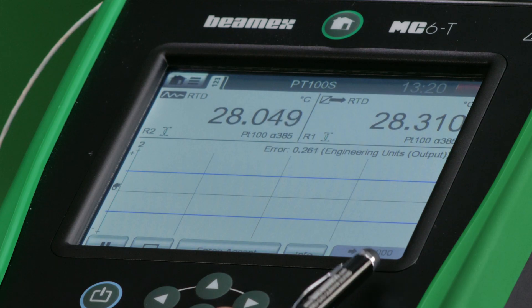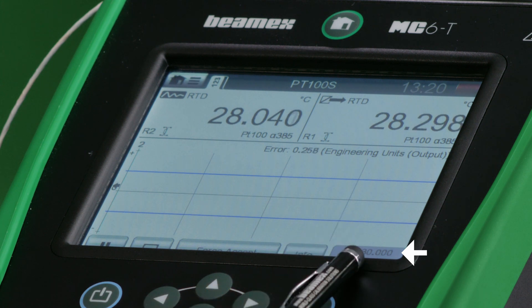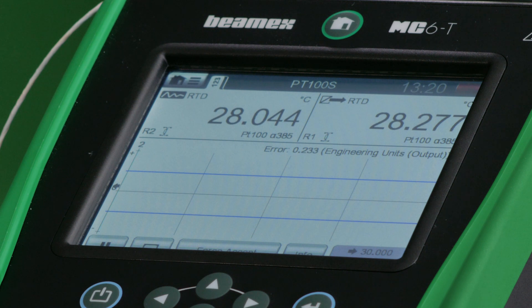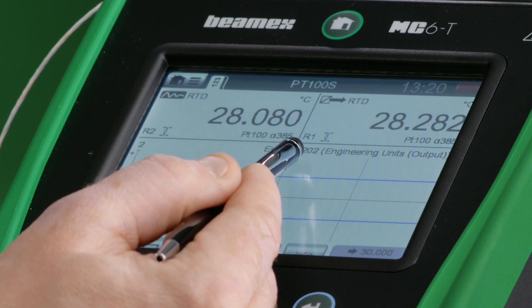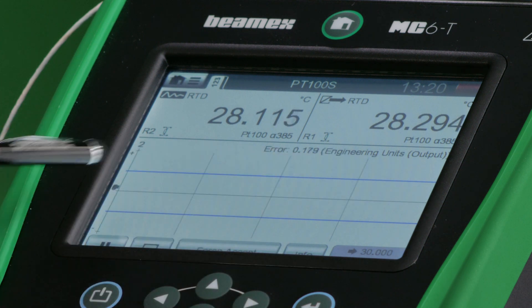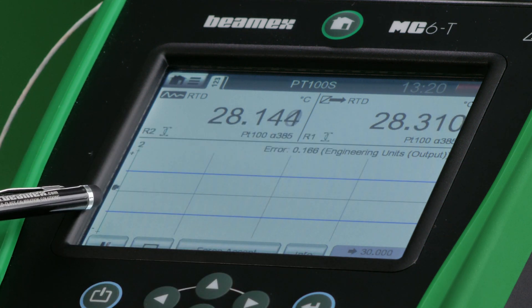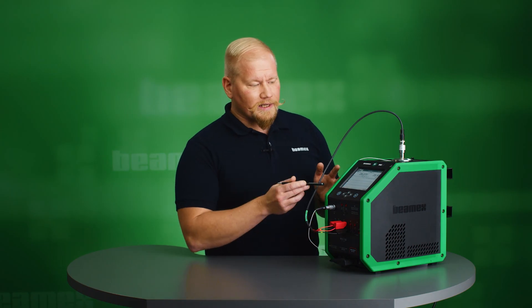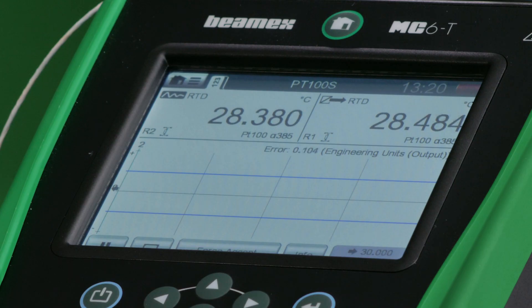I'll hit start and begin my calibration sequence. On screen, you can see my set point — the first point is going to be 30 degrees Celsius. The MC6T is constantly calculating the error, comparing the reference to my sensor values, and showing the error value as well as a graphical view. You'll see a green dot traveling between two blue lines — if it's below or above, it's a failed calibration; as long as it's inside, it stays green and is a pass. This also documents the results, eliminating the need for pen and paper and reducing human error.